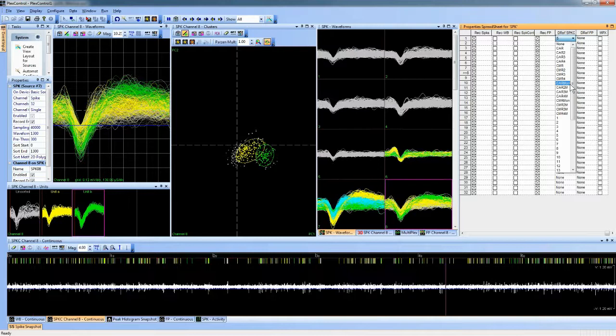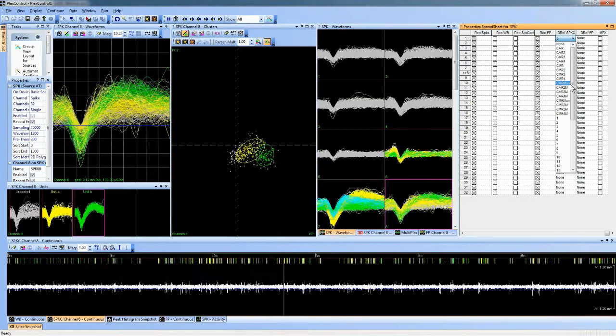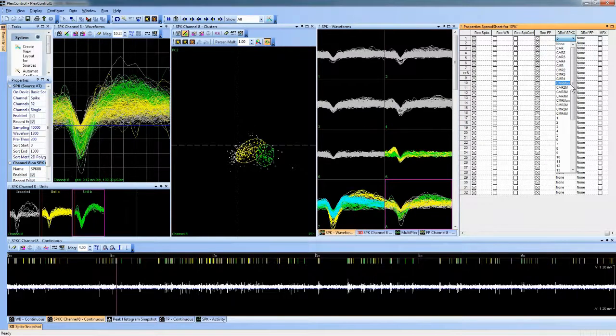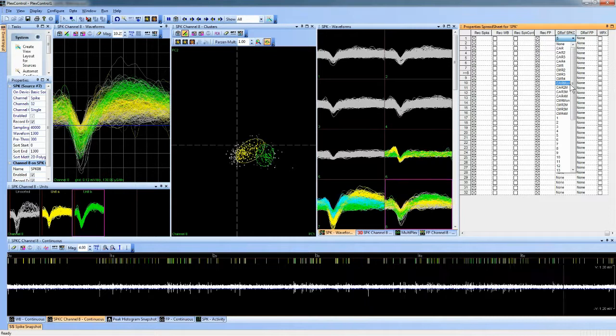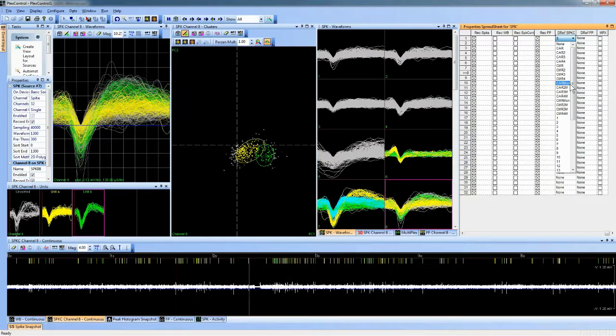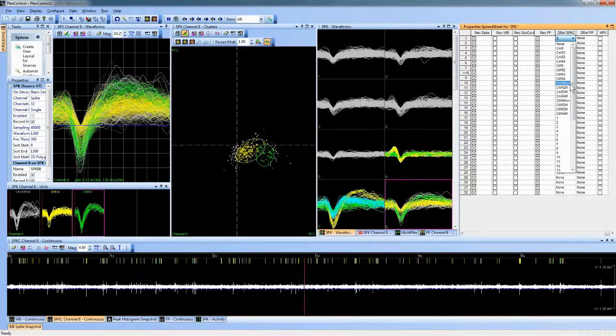We strongly recommend using a monitor channel whenever using CAR or CMR. But it's also possible then to record that channel if we wanted to visualize it or use it offline. So if we select channel 11 to be the CAR-MON and we decide to save channel 11 to our data file, what will be on channel 11 then is no longer the electrode from the head stage channel 11. It's actually the average of the channels that we had set to CAR. It's another good question. Perfect.